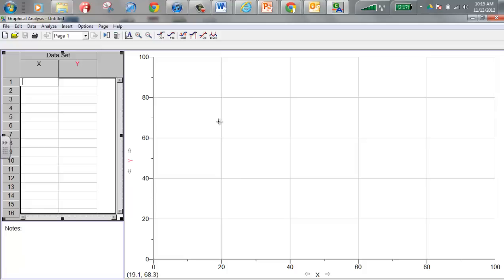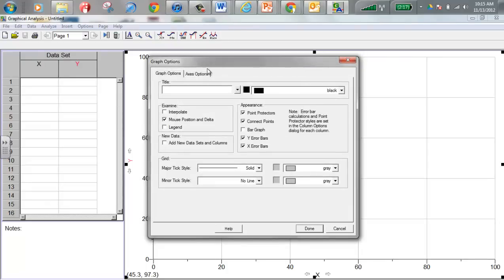When I use Graphical Analysis, the bottom line is if I want to change something about the graph, I double click on where I want to change it. That's sort of a general rule. The first thing I'm going to do for a graph is make a title. So I'm going to click on the graph and what comes up is this Graph Options window. You can also get to this Graph Options window through the options menu option at the top of the window.